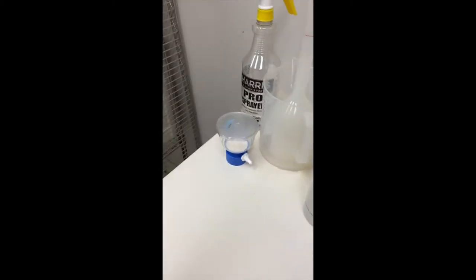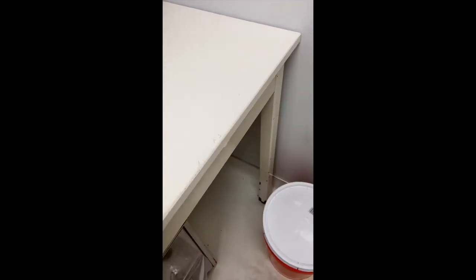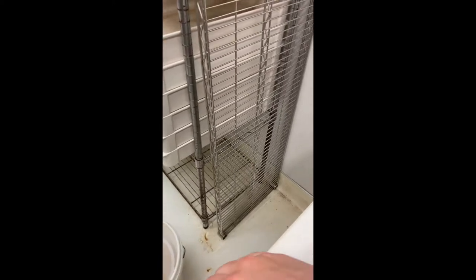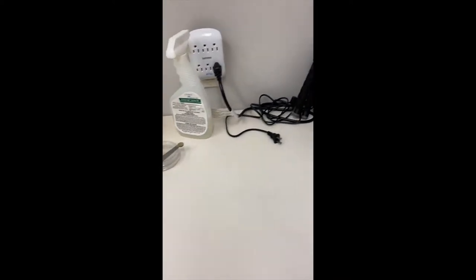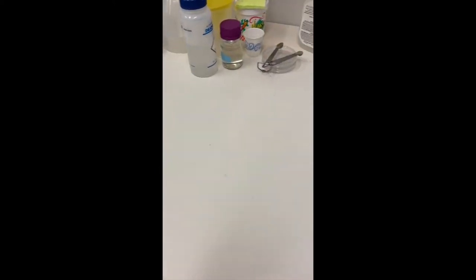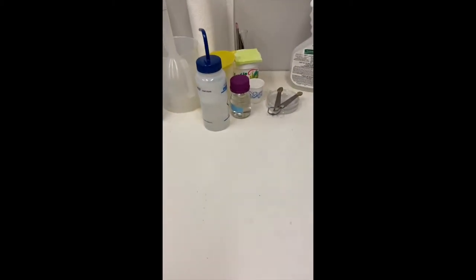So you spray, and then wipe it with a paper towel, and make sure you get the edges of the bench where you touched as well, just to keep everything super clean so that nothing contaminates the larvae or the eggs. And then you're all set for the bench and you just cut them off.